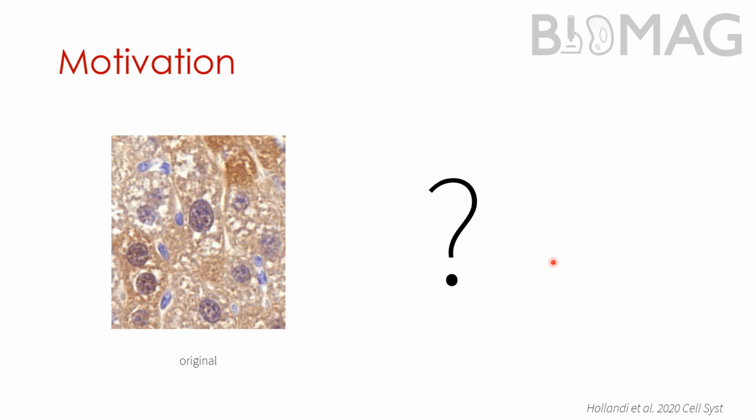Suppose that we have a new experiment that we've never worked with such samples before, and the images look like this. We can see that this is a tissue with a rather complicated background. Since it's a tissue, nuclei tend to fade into the background because they are not cut at the right Z position in the volume. So it is rather difficult for an image processing algorithm to accurately identify the nuclei.